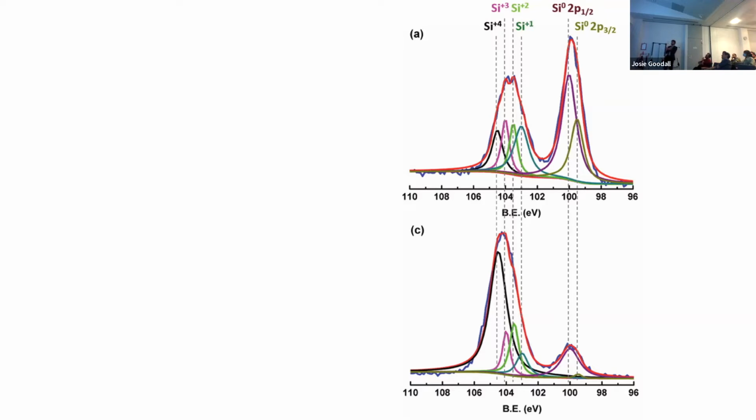So here we have an attempt to fit some silicon peaks. This is actually a little bit subtle, a little bit hard mode. But what they've done here, they've fitted the 2p3/2 and 2p1/2. Those are two spin orbit components of the 2p orbital. But unfortunately for them, they fitted them the wrong way around. The 3/2, the larger J value, is always the most intense. But unfortunately, they put them the wrong way around.